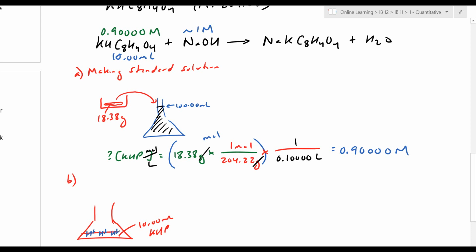So there's H+. There is an NaOH that I'm going to slowly drop into the solution. I know it is roughly 1 molar. But the goal in this question here is actually to figure out what is that exact molar, what is that to a better precision. So you saw me do this in 3 different trials.